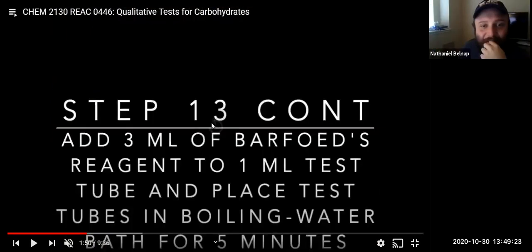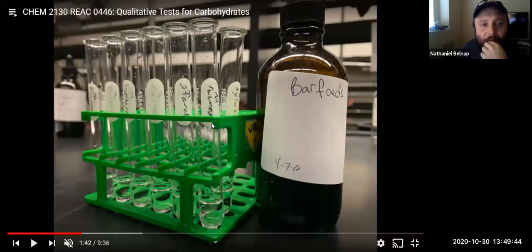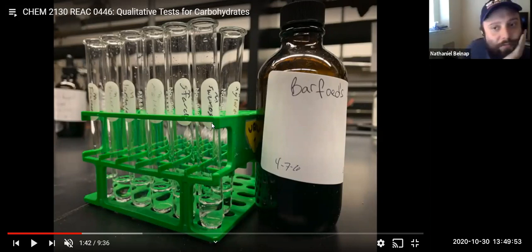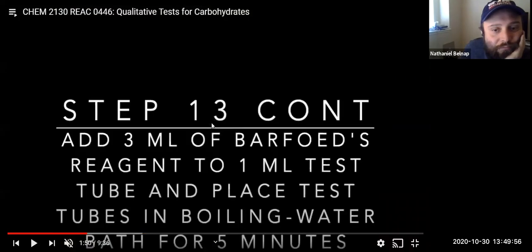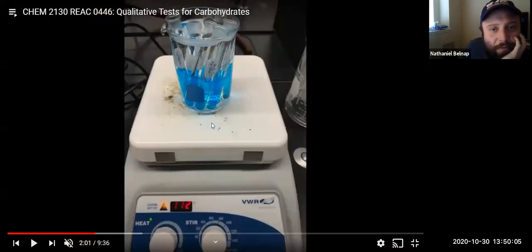All right. So we see here that we added 3 mL of the Barfoed's reagent to 1 mL of the test tube and placed the test tube in boiling water for 5 minutes. Does he say, yeah, I think he says what the list is. Looks like it says fructose, glucose, lactose, maltose, starch, sucrose, and xylose. And I want to say this is after the boiling, but let's see. Oh, no. So it's in the boiling.